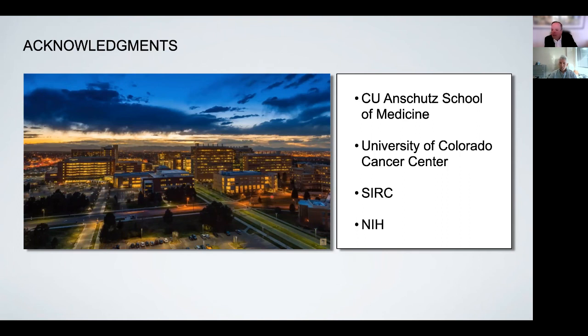And with a good specimen, that could give you hundreds of thousands of images and ideally a near atomic resolution structure. If you work with things that are harder to get at high concentration or that are more dynamic or more challenging, like some of the complexes that my lab works with, then you will be talking about larger data collection times, and that will increase the cost of using the facility.